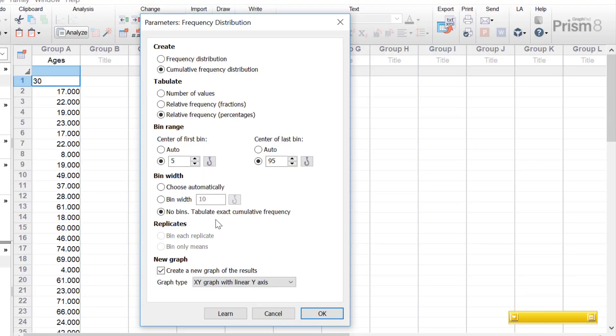How do you select the optimal bin width? This depends on your sample size — with a larger sample size you can use smaller bin widths and still have a smooth frequency distribution. Letting GraphPad decide on the bin width is usually best. There's also the replicates option: you can either bin each replicate treating it as a separate value, or bin only the means so GraphPad averages the replicates first and then uses the mean value for binning.